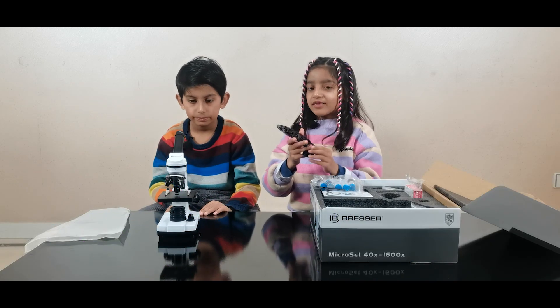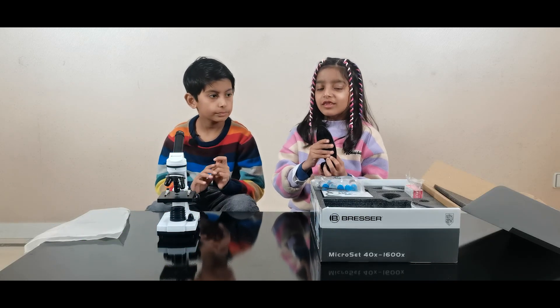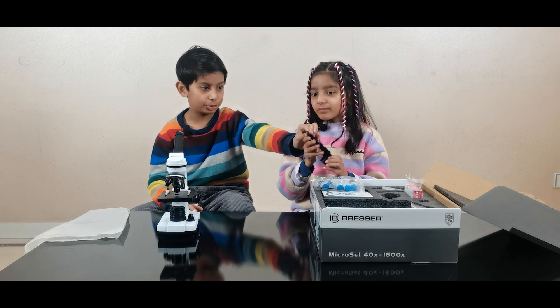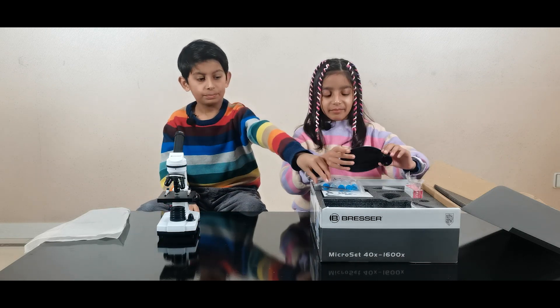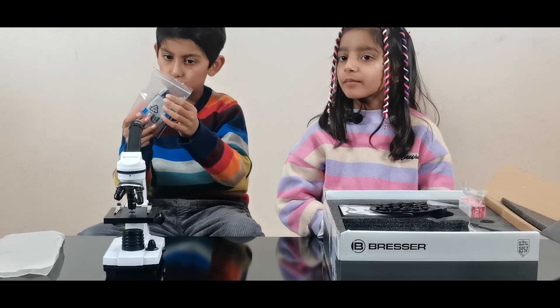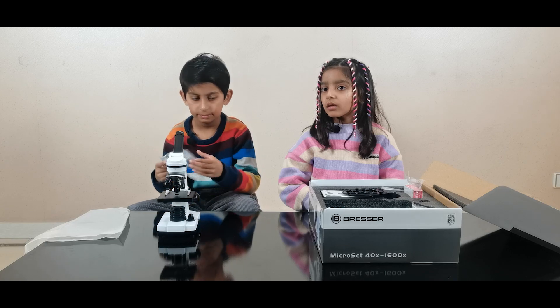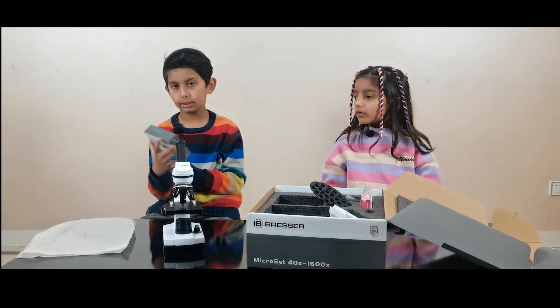So guys, this is a spoon stand, and we can see very small things with our spoon. It's so sticky. Hi guys, these are the yeast and shrimp sticks — we'll show you those later on.